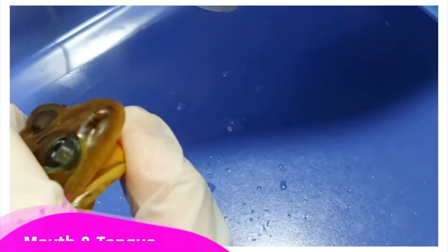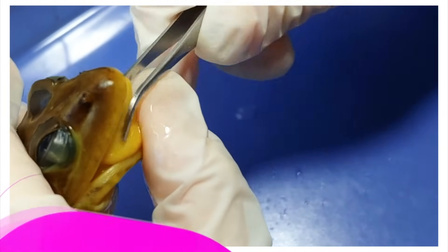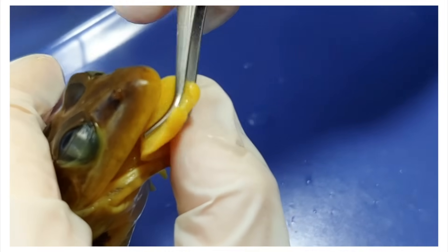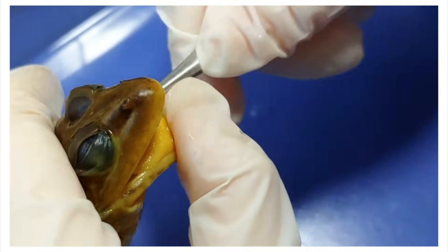If I open the frog's mouth, you can see the tongue. The tongue actually flips outwards like you can see here, and the frog catches its prey with the tongue and pulls it into its mouth. Like that.